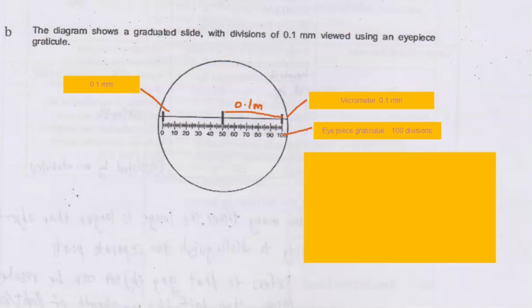So how can we find one division of the eyepiece graticule?